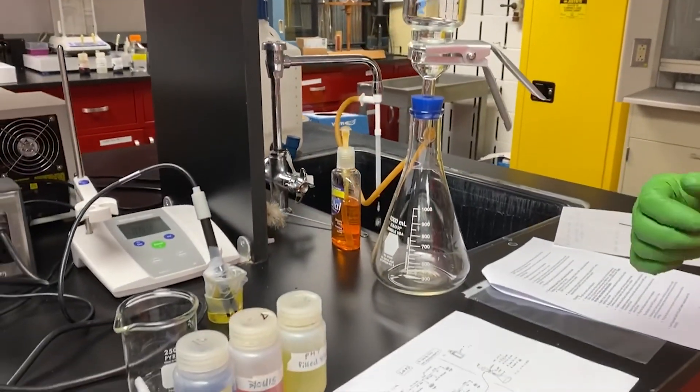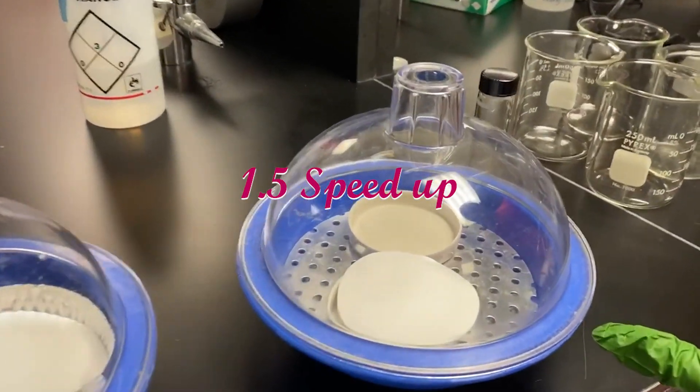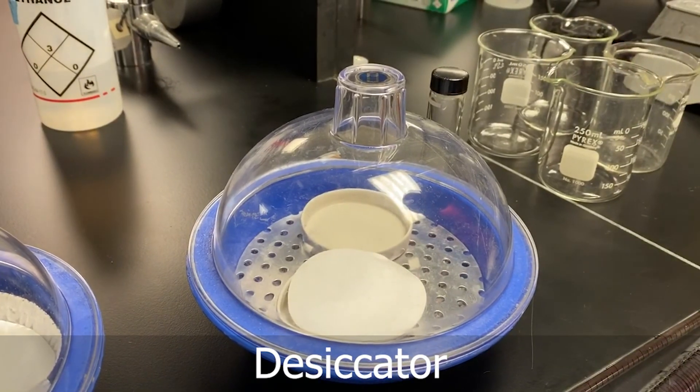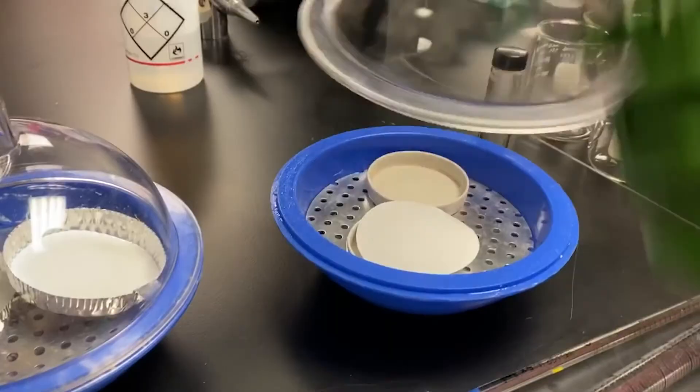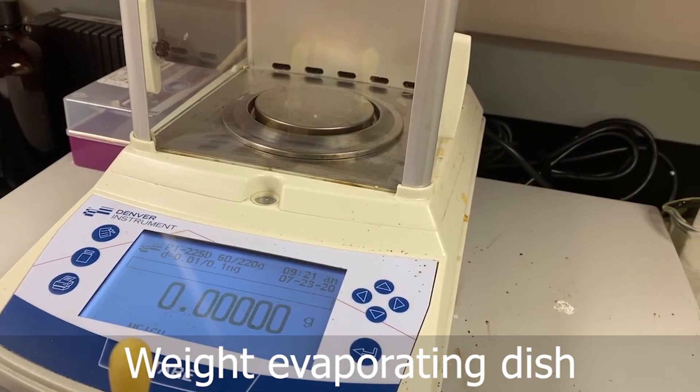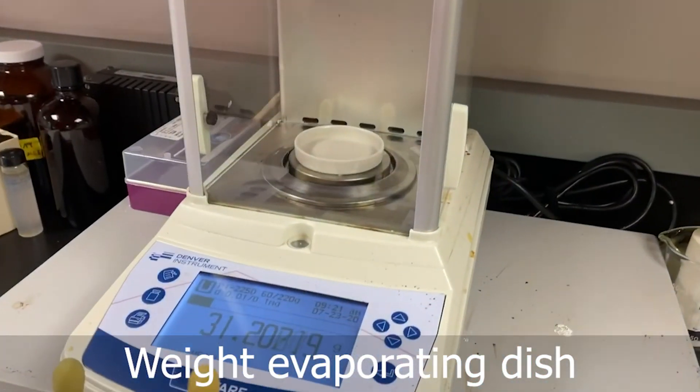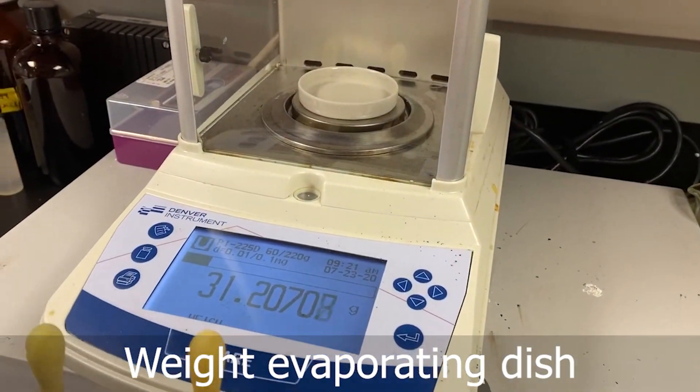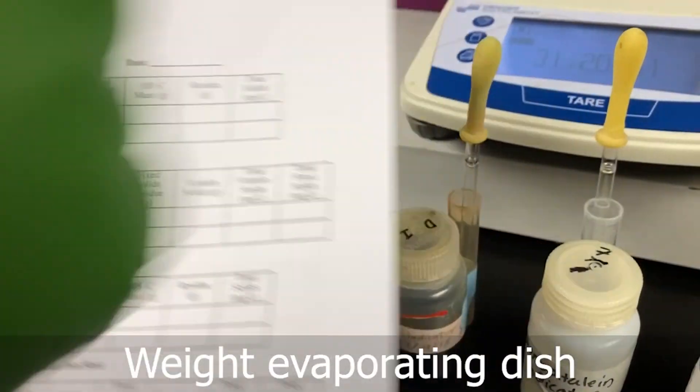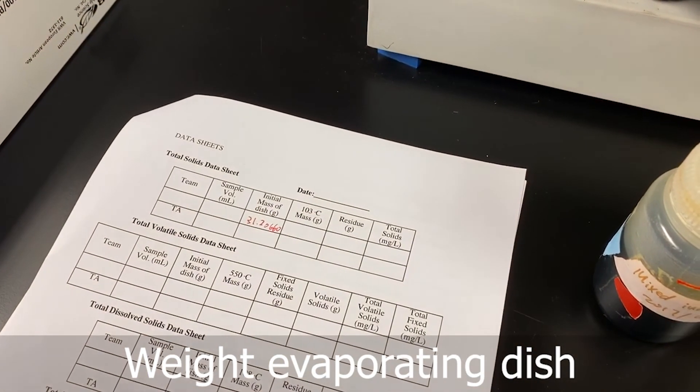So let's get started. We have all of the stuff in this desiccator because we want to avoid water getting into our equipment. The first one is the total solids. We just grab the wastewater sample dish and then we can measure the weight. In the datasheet, this is the initial mass of the dish.